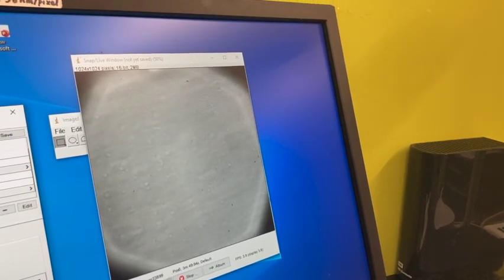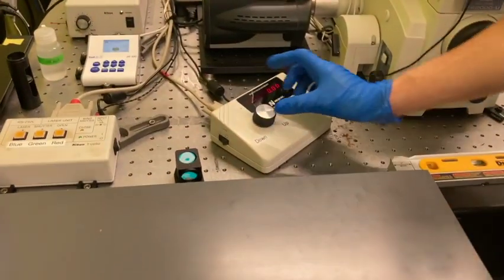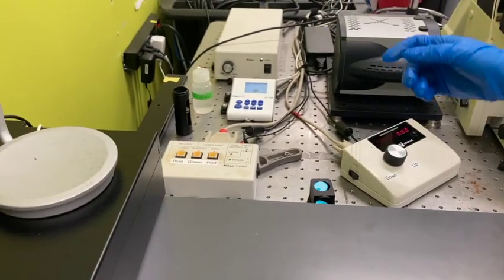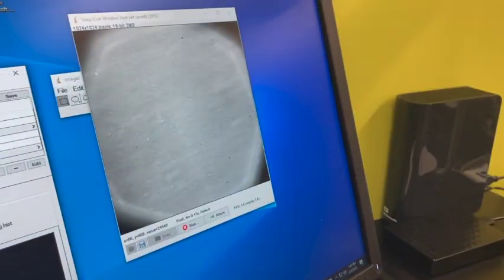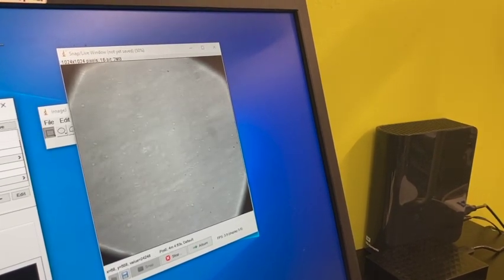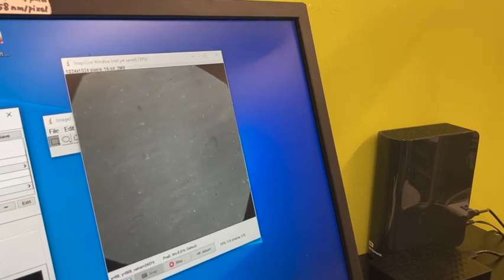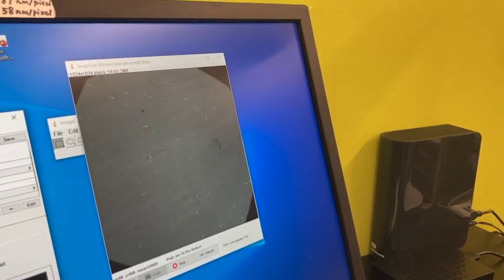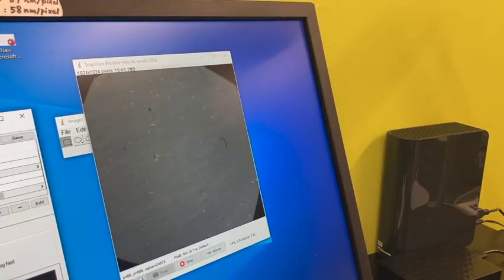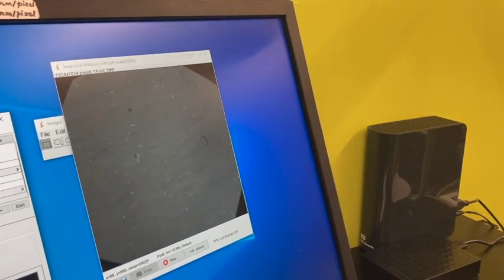And right now, you can go to this fine adjustment. This is connected to a motor inside this camera, and it goes in microns. So if you go up a little bit, then we are on the surface. We are on the surface when you find the rays, a very sharp edge on this. So whenever this is in focus, you are in focus.